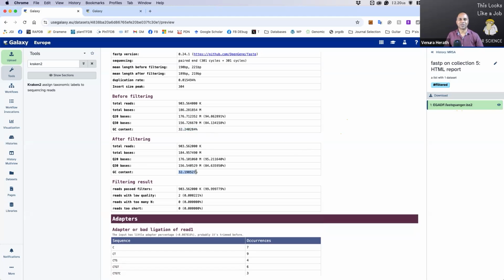So you're not going to do a statistical analysis, because it goes from 0 to 100. For that particular species, it's around 32. And the mean value changes only in the decimals, so therefore it's an approximation. There's no statistical test done.